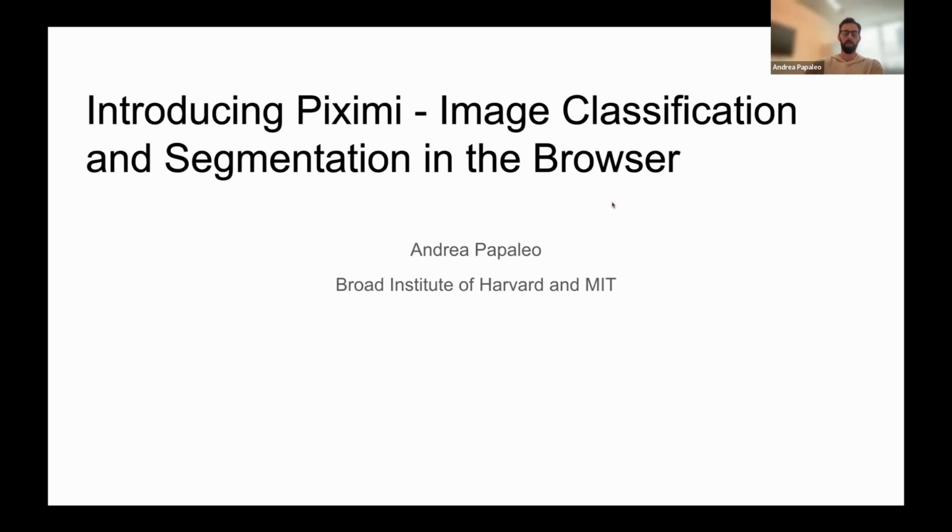So I'm Andrea Papaleo. I'm a software engineer here at Broad Institute of Harvard and MIT. I'm part of the imaging platform. And I'm gonna talk to you about Piximi, which is an image classification and segmentation tool in the browser.